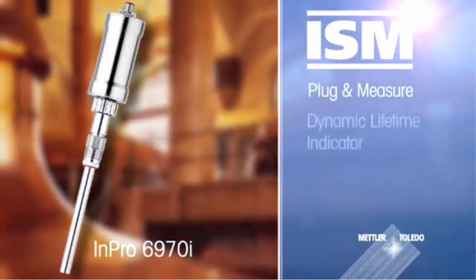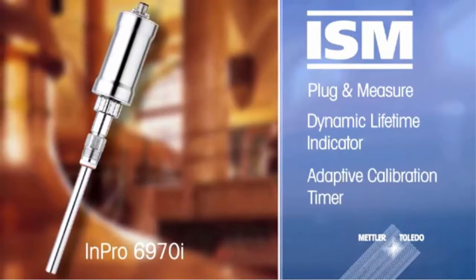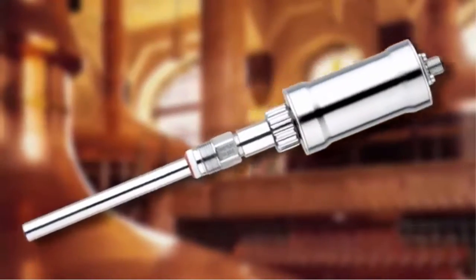Intelligent Sensor Management, or ISM, is a feature of the Impro 6970i that offers significant benefits to breweries. Now that you know how the Impro 6970i helps breweries ensure oxygen-contaminated products don't reach consumers — enjoy your beer!